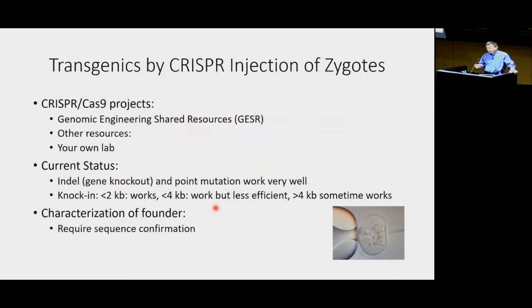So there was some confusion, and later it became very clear the original approach to make conditional alleles did not work well, at least. But later, when people designed the template and provided the donor, they used single strand or long single strand DNA that you can synthesize. And that improved the result significantly. So if your donor is less than 2 kb, that's a lot better.